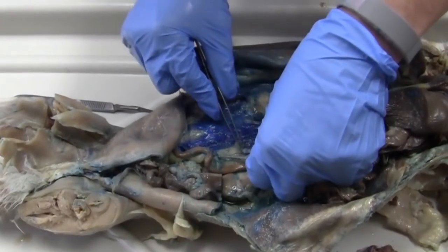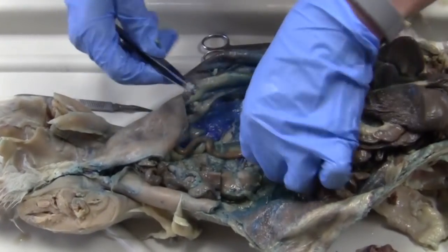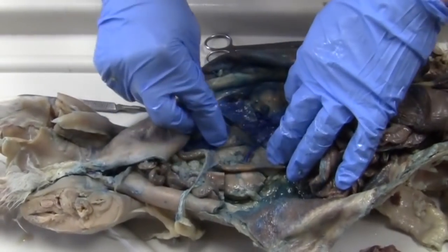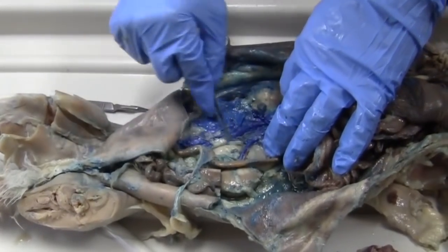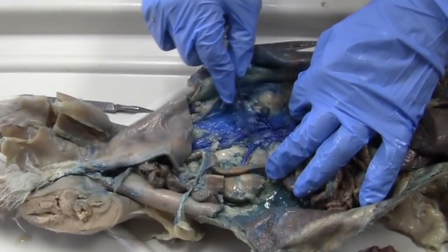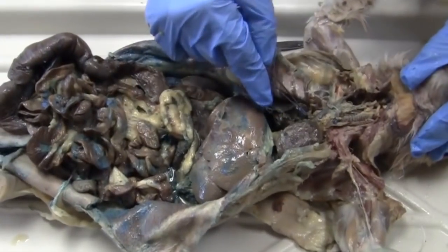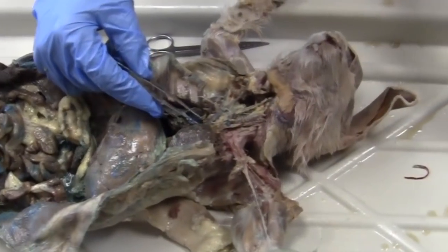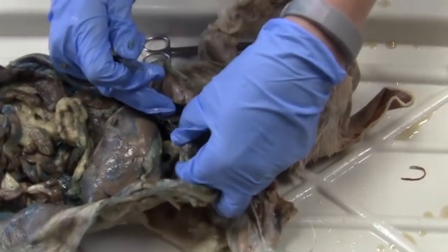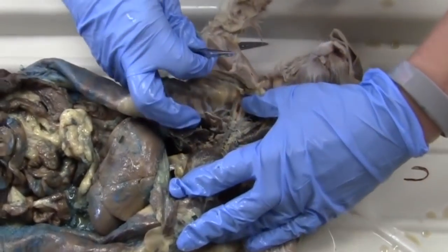How I'm finding this is I have my renal vein and it's coming into the caudal vena cava, so right here. Okay, moving back up. Cranial vena cava, and caudal vena cava. I also want to show you, and I may have to wait till we get done and cut out the heart. You are going to cut out the heart today.